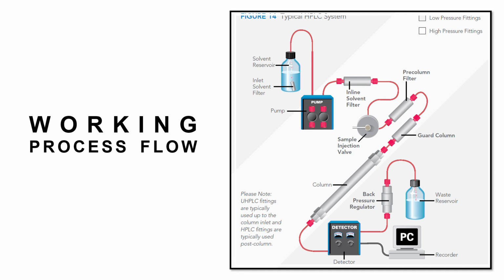Now we will see how we can read the chromatogram. The word chromatogram means a plot obtained via chromatography. The chromatogram is a two-dimensional plot with a vertical axis showing the concentration in terms of detector signal intensity and a horizontal axis representing the analysis time. Retention time is the time interval between the sample injection point and the apex of the peak.